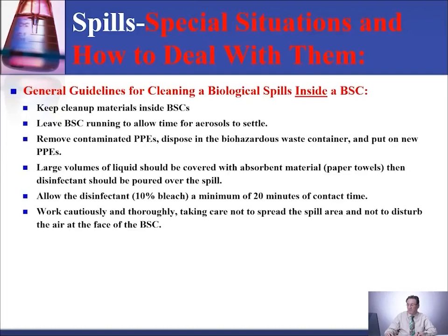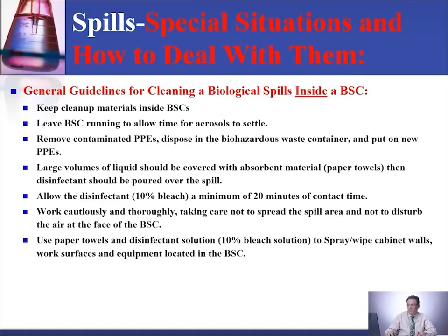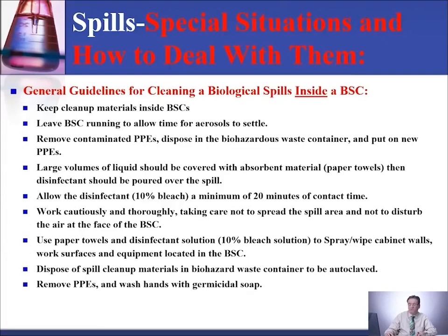Work cautiously and thoroughly, taking care not to spread the spill area and not to disturb the air at the face of the biosafety cabinet. Use paper towel and disinfectant solution, 10% bleach solution, to spray and wipe cabinet walls, work surfaces, and equipment located in the cabinet. Dispose of spill cleanup material in a biohazard waste container to be autoclaved.